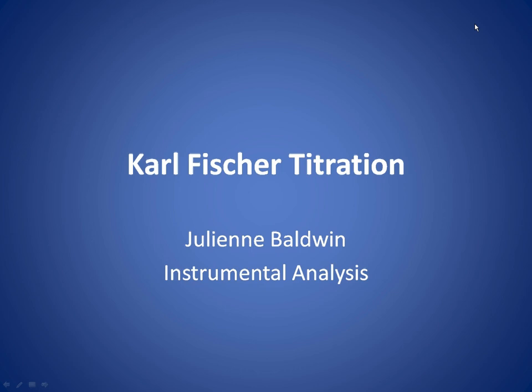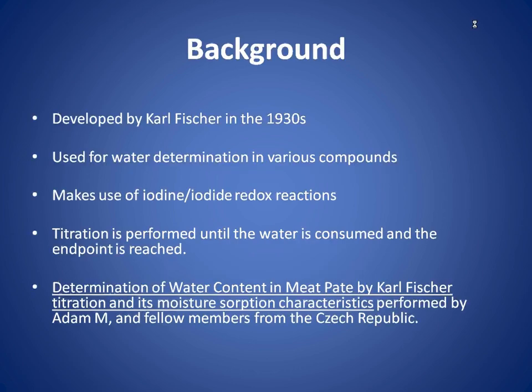Karl Fischer titration. Karl Fischer titration is a method of titrating developed by scientist Karl Fischer in the 1930s. Since then, the method has been used by scientists everywhere to carry out experimental procedures.